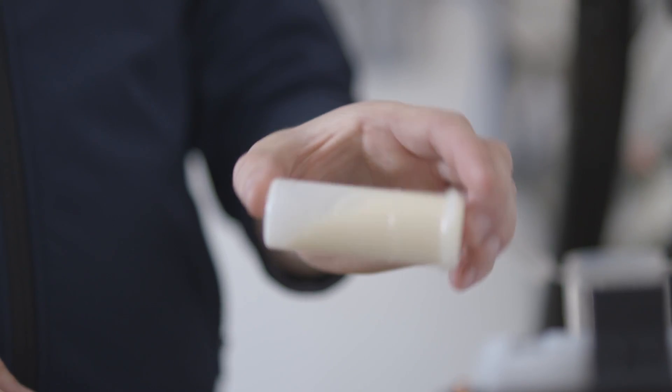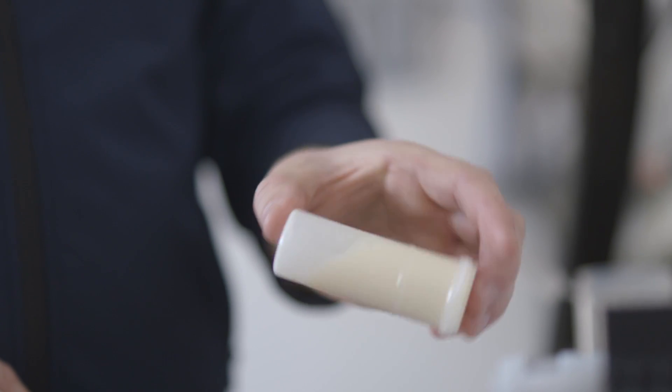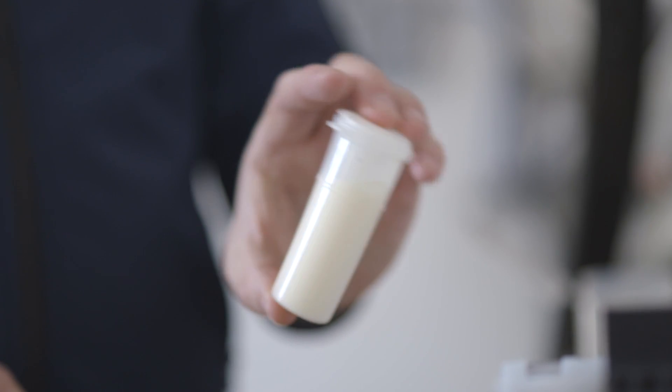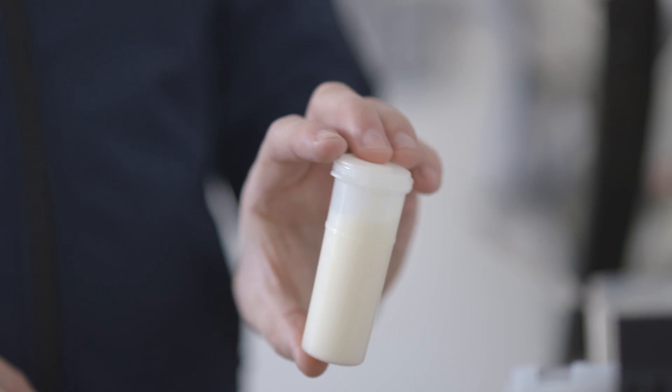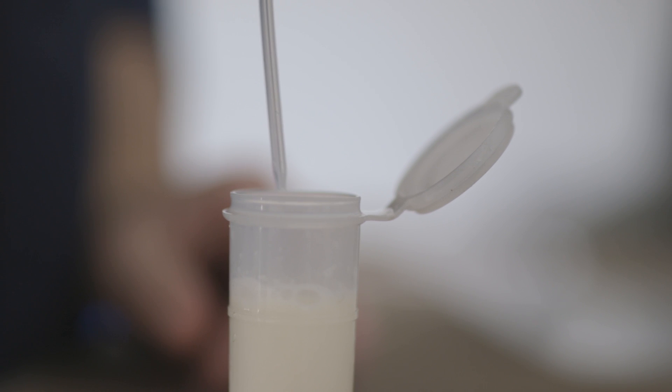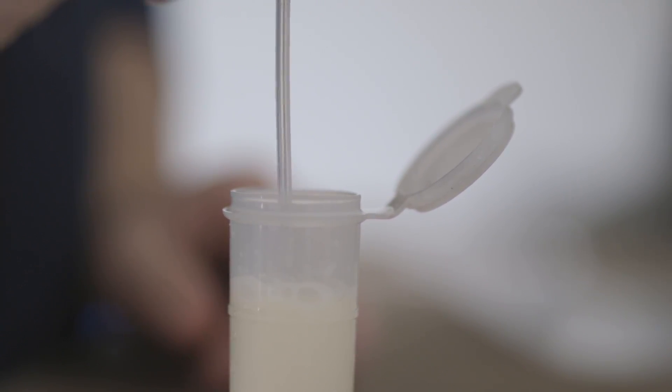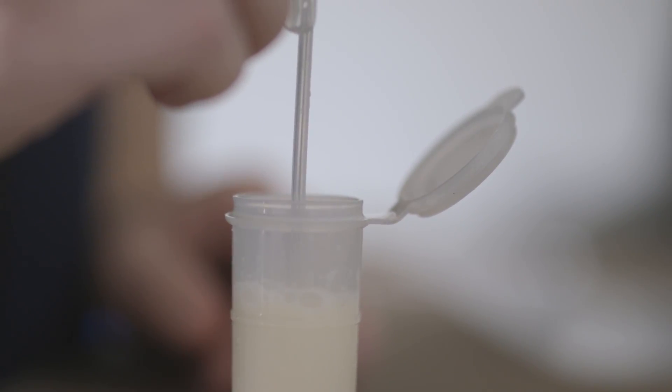We take our milk sample, again this can be either a cow sample or a bulk tank sample. We agitate it gently, we select a fresh pipette every time, we don't reuse pipettes.